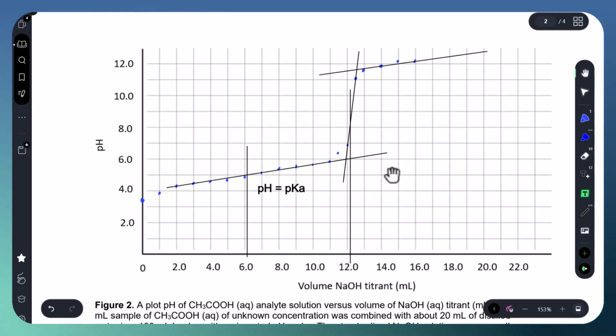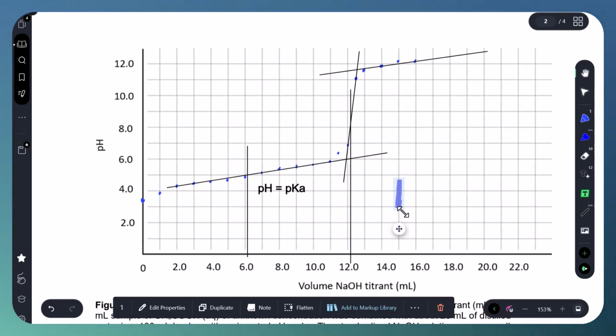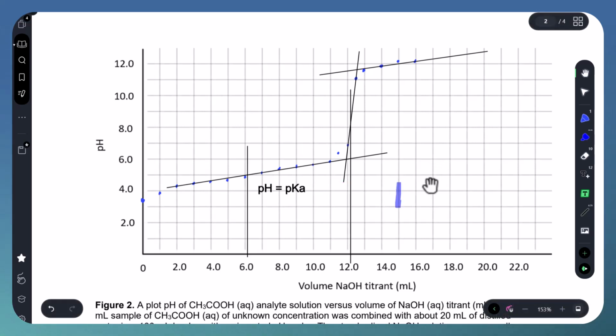And for that same indicator, I am going to indicate, so this is going to roughly start at a pH of about 3 up to 4.6. And let's see if I can adjust this a little bit. So bring that up to 3. I may not be able to bring it down too much. There we go. It's kind of close to 4.6. Once again, I'll label. So this is the bromophenol blue.